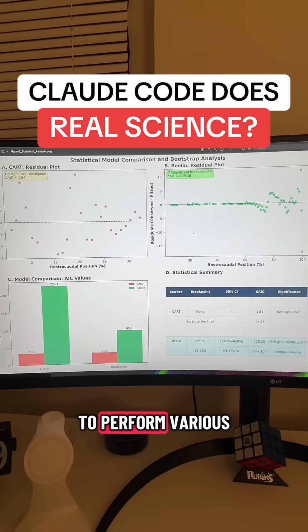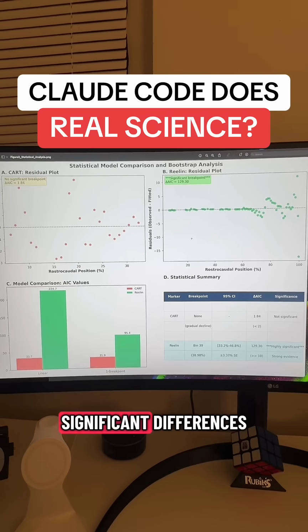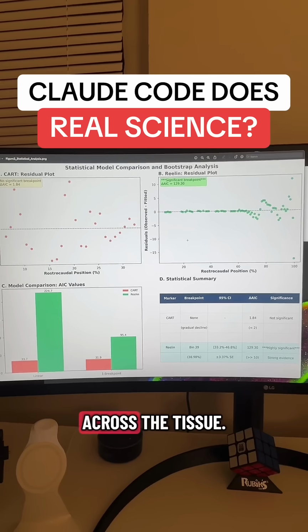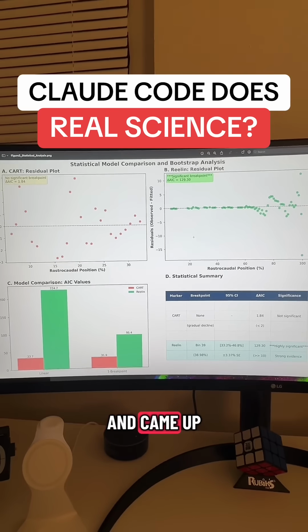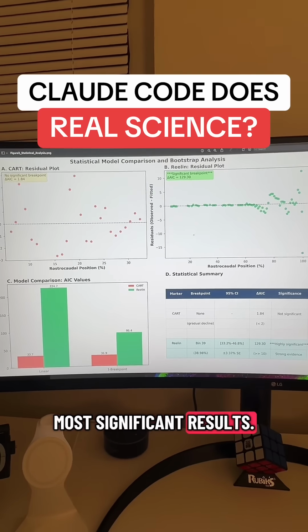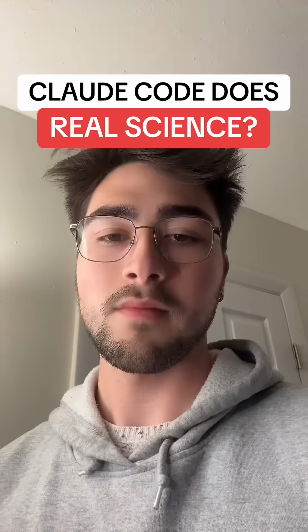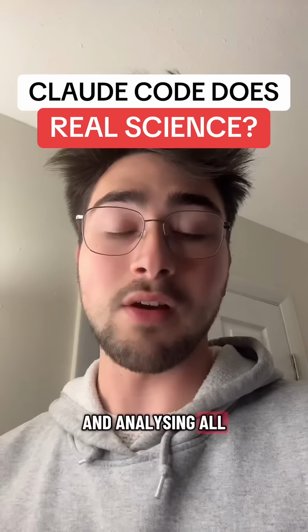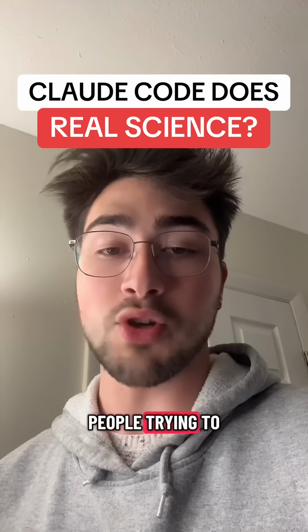Then I prompted Claude to perform various different types of statistical analysis on my data to see if there were any significant differences in how the proteins were expressed across the tissue. It then compared the results of those different statistical models and came up with the one that yielded the most significant results, and it generated all four of these beautiful plots to convey the results. After collecting, compiling, and analyzing all of my data, I can now talk with Claude about how it would be best to display this data to people trying to understand it.